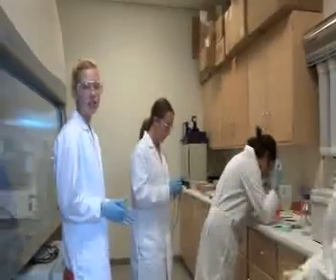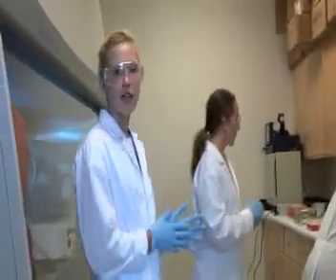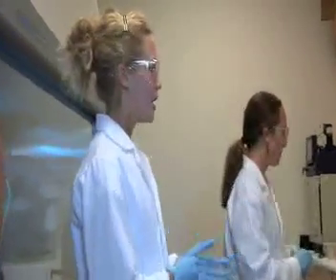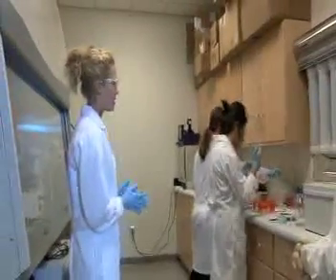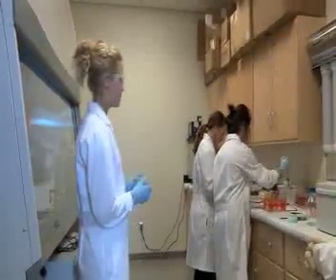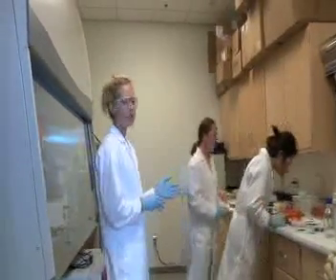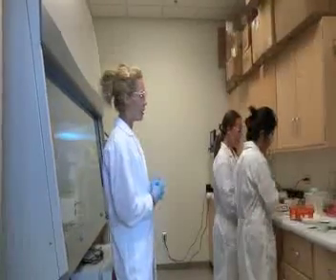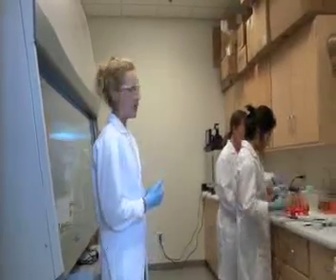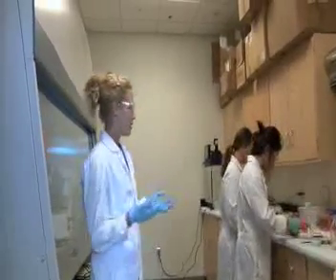Yeah, right now Nazanin is putting our DNA that has been amplified in the PCR machine into her gel, which we poured earlier. This is a stained DNA, and we will run it in the electrophoresis and see how it comes out and compare it to the allele ladder. That will let us know which suspect is the person who committed the crime.